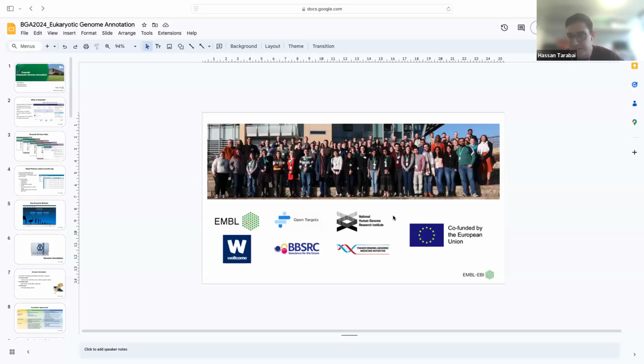But the Ensembl pipeline only uses RepeatModeler, while people working on repeat annotation in plants use a combination of tools like RepeatModeler, RepeatExplorer, TE cluster, or LTR tools, and all of the results are combined together and then masked.